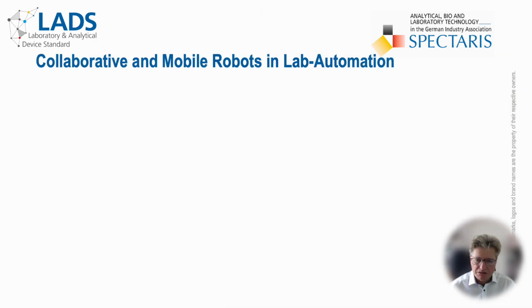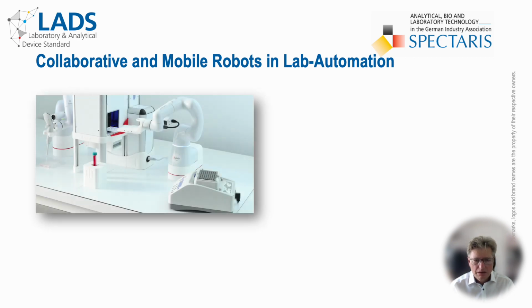When attending trade shows and conventions in the laboratory and analytical domain, when talking to end users, automation with collaborative and mobile robots is at the top of the list, along with connectivity, FAIR data, and machine learning. Here are some typical examples.